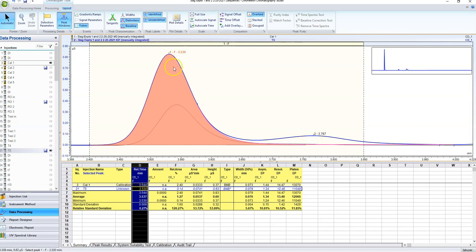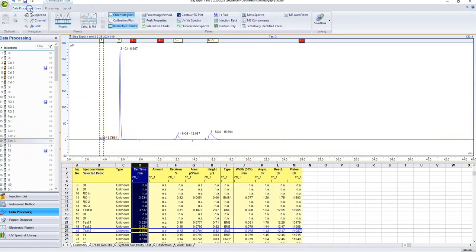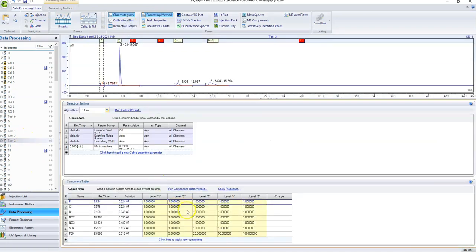This is a really useful tool for peak checking, making sure that your peak is actually what you think it is. You should always do this if you're ever worried that something is not the same chemical as was in your calibration standard. So all you really need to do is put all of the values in for your calibration points. So if I wanted all of this data, I would need to fill all of this out before I take all my data off, copy and paste it into Excel, and if you ever get stuck, just ask someone who's familiar with the IC to help you.